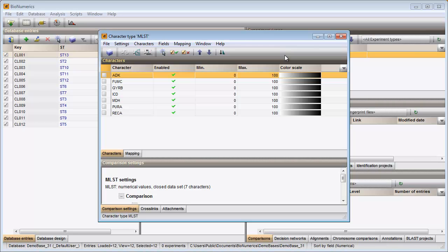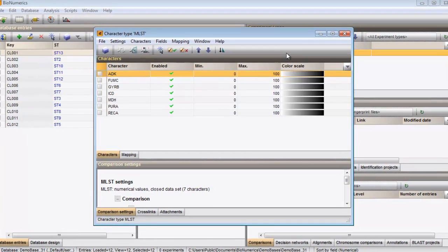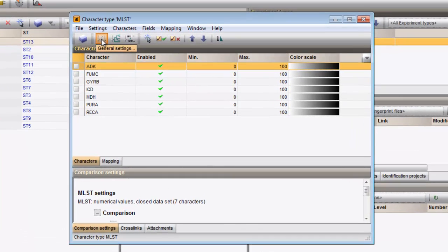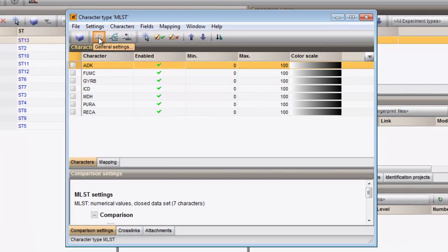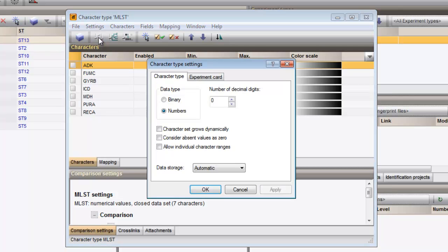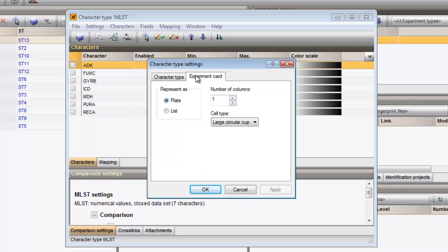The characters are listed in the upper panel. I open the settings dialog and select the experiment card tab. Since I want to see the imported values in the list, I change the representation to list and close all windows.